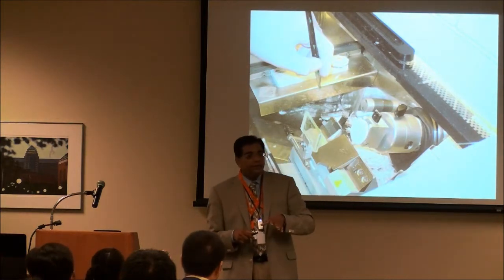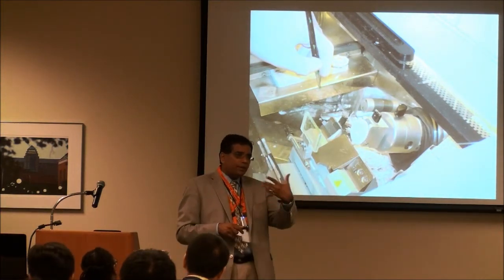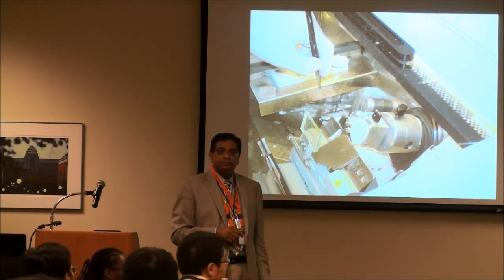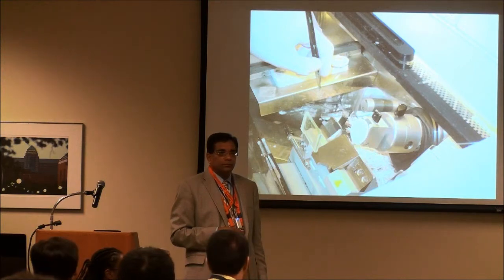No, it's okay. It's okay. That's all right. It's a wonderful question, but can you explain it to me one more time? So, are there artifacts in the tissue preparation that affect the properties of the living tissue, right?